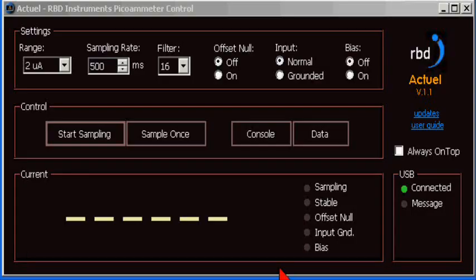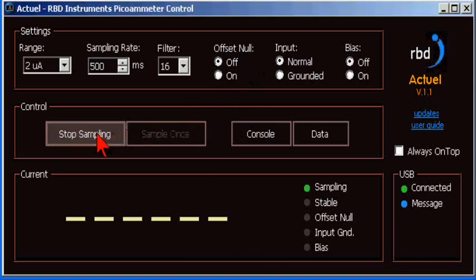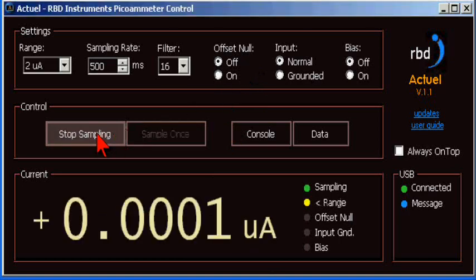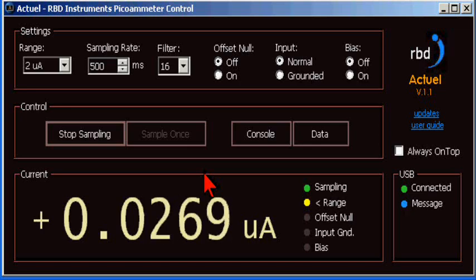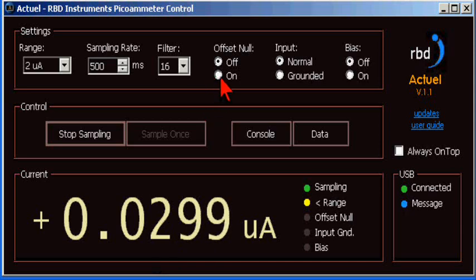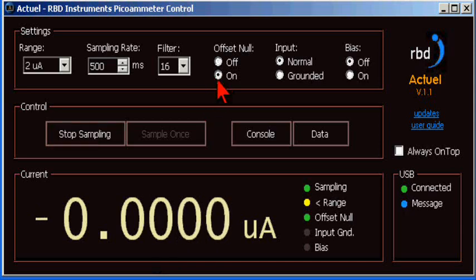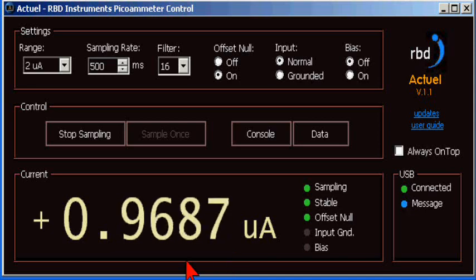Finally, let's look at the null. First, let me put a slight offset into the current. About 0.03. Now, when I turn the offset null on, the offset current is subtracted and the reading goes to zero. Now, I'll put 1 microamp of current into the picoameter and we'll see that when it settles in, it's low by the amount of the offset that I subtracted.